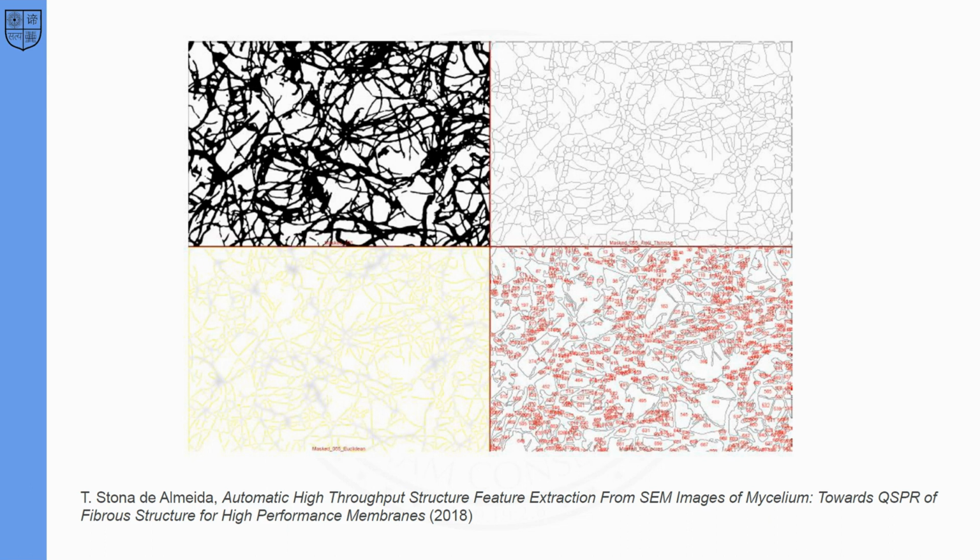But the visible stability of clustering principal components and similarity of feature distribution suggests that this protocol can be adopted to automatically remove artifacts after automated segmentation and feature extraction from the mycelium micrographs, and potentially be a method to be generalized and benchmarked for larger collections of micrographs. Other limitations of the protocol that deserve attention are related to the human factor.